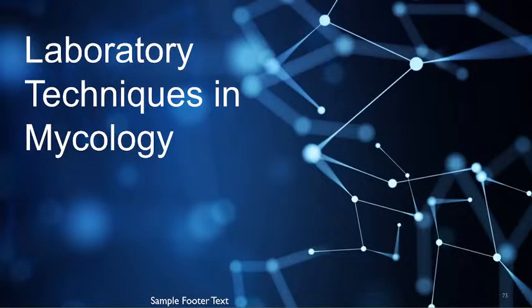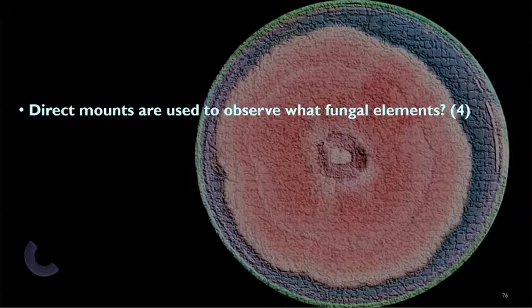Majority of the questions in your exams will be here. Direct mounts. Let's talk about the direct mounts. The direct mounts are used to observe fungal elements. What are we looking for in the microscope? Again, as I mentioned before, units. We're looking at the single units.